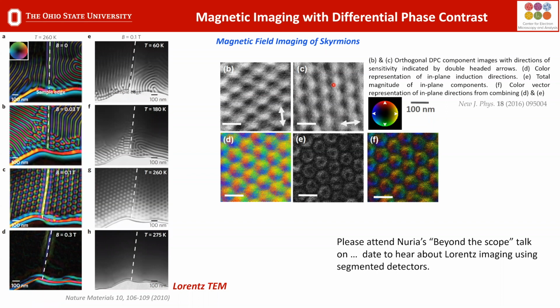So when we use an annular bright field, or when we use a segmented dark field detector, that segmented dark field detector is missing the center of its disk. What that means is we're only collecting the outer edge of your transmitted disk. Most of this grain information, this is a defocused image here, is what creates some of the problems.